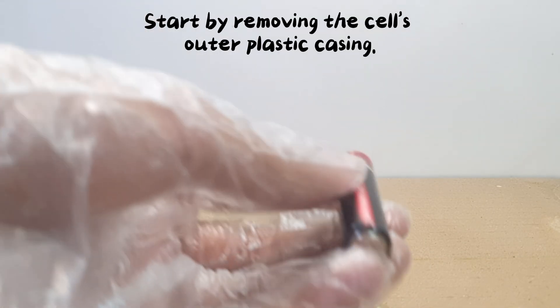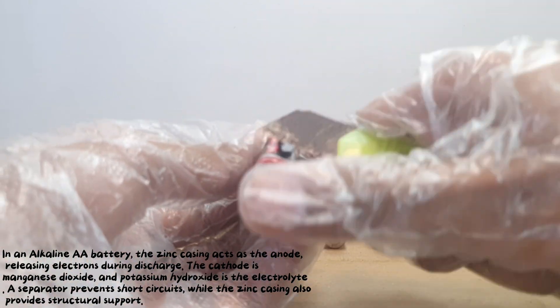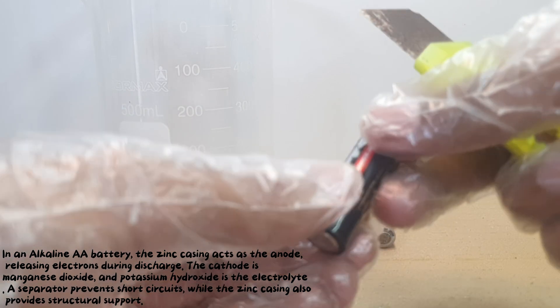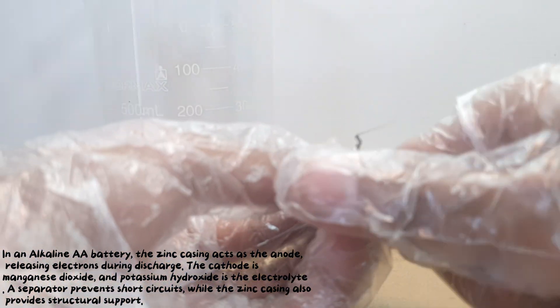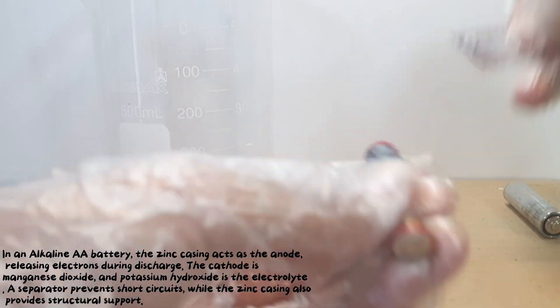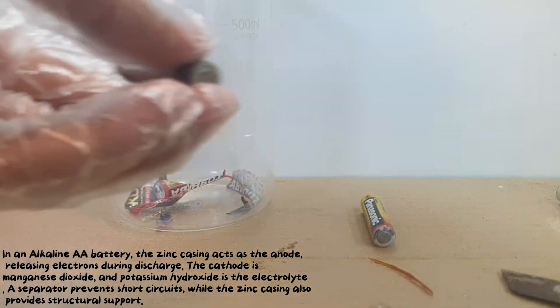Start by removing the cell's outer plastic casing. In an alkaline AA battery, the zinc casing acts as the anode, releasing electrons during discharge. The cathode is manganese dioxide, and potassium hydroxide is the electrolyte. A separator prevents short circuits, while the zinc casing also provides structural support.